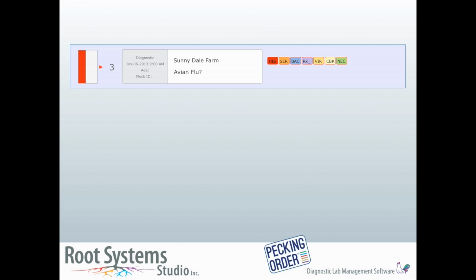It's helpful to know how the list sorts. We sorted our cases by priority, and we sorted our services within each case. But what's the connection between case priority and service priority? The answer is very simple, and the result is an extremely powerful innovation to allow true collaboration: visual escalation. The highest priority service status of a case determines the status of a case.